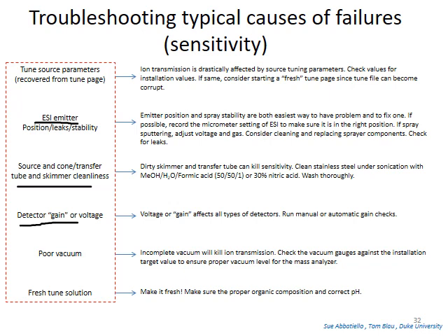Detector gain. This is more directly related to the previously mentioned MCP value. You may manually increase the value to bring back sensitivity, but do ensure you have ruled out other causes before you change MCP values.